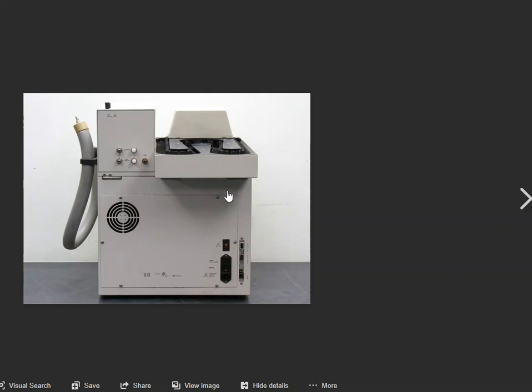Here's the back end of that Headspace unit. What you're seeing is basically a fan that helps cool everything down and get it ready to be heated all over again with a sample. Back here on the back are the power cords and the hookups to the GC instrument, so that way it can start relaying the messages to the GC that it's ready to inject a sample on it.